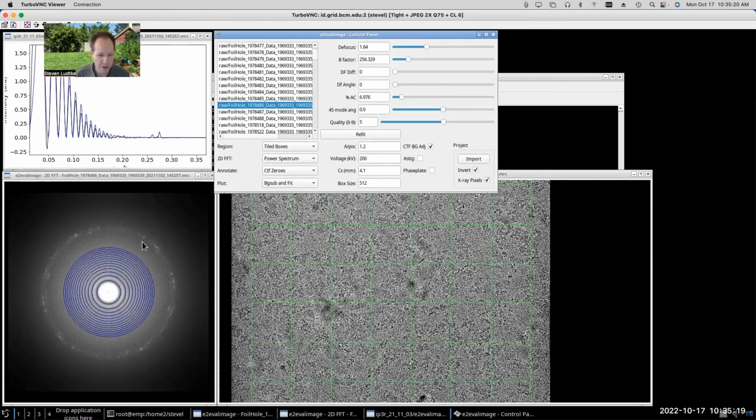If you go through, say, the traditional Relion processing, run your frame alignment, then GCTF and run Relion or something like that, it's not always going to do a good job of catching some of these images to get rid of them. If they have a strong CTF, it may include them in your data, and it may actually hurt your reconstruction rather than helping it. If there's only a few, it's not going to be a big deal. But if half of your data set, and it does happen from time to time, is weak data, then it may impact your reconstructions.